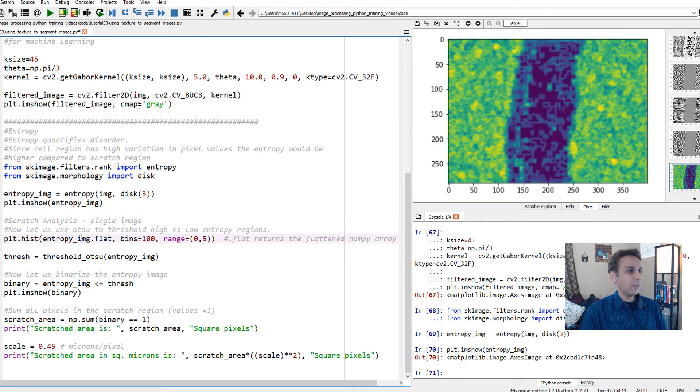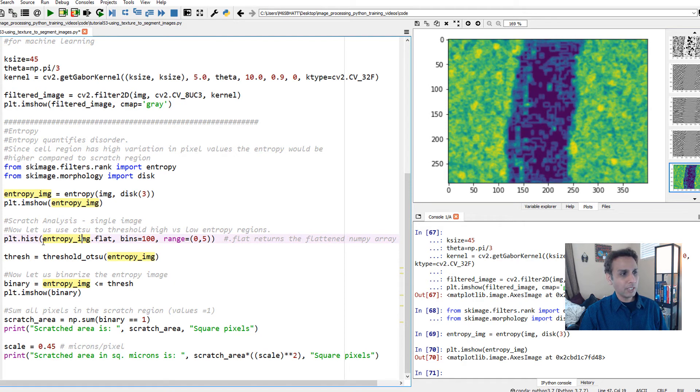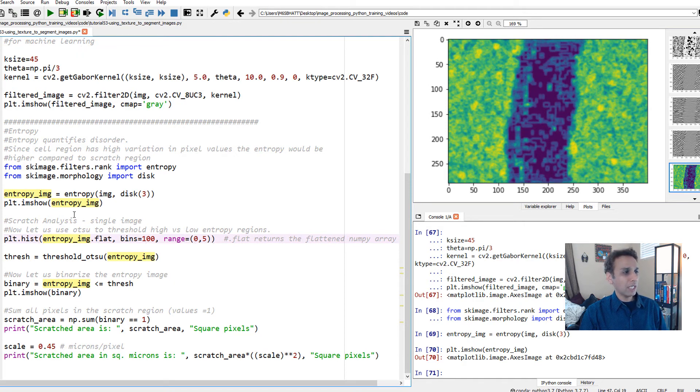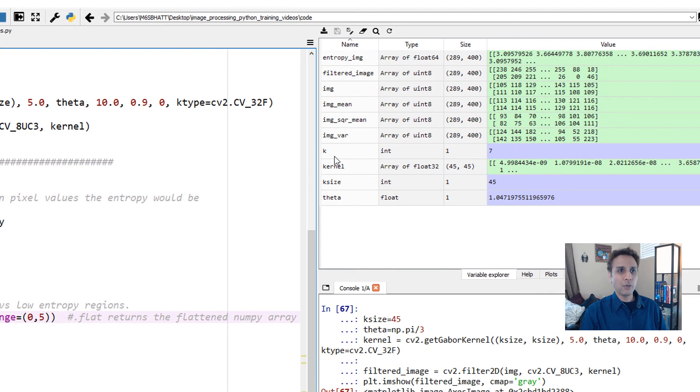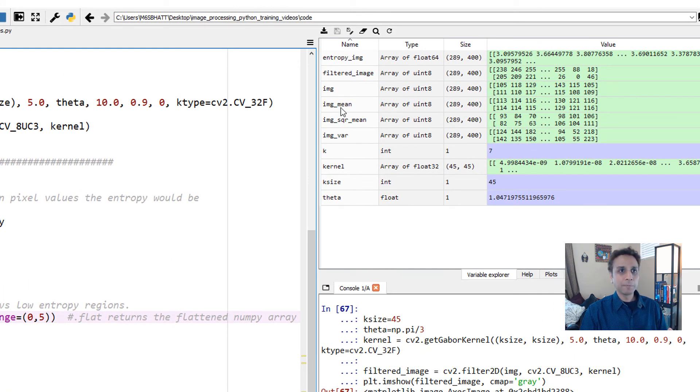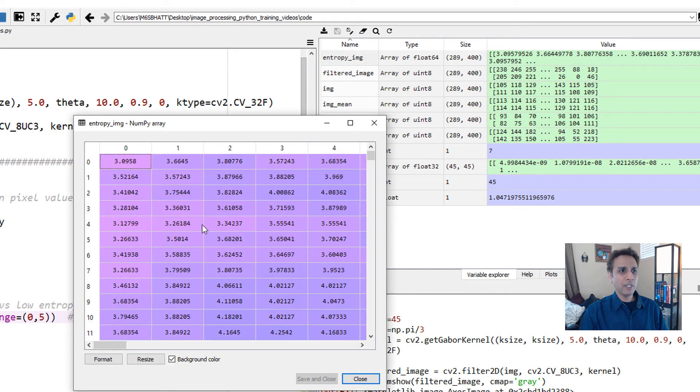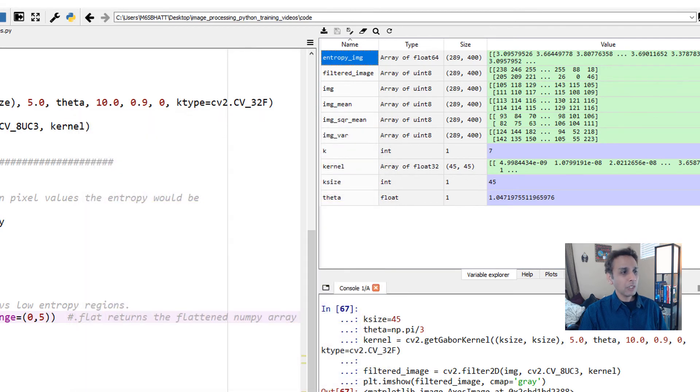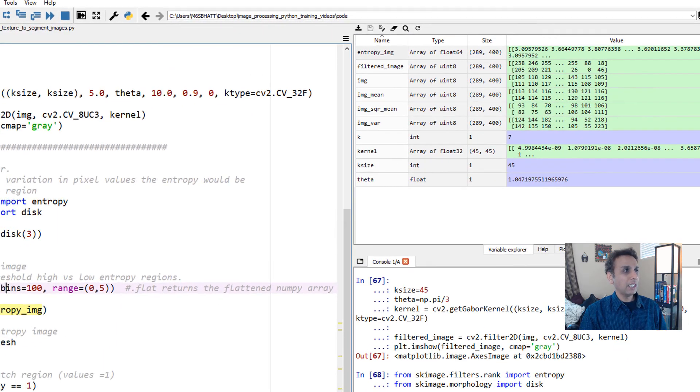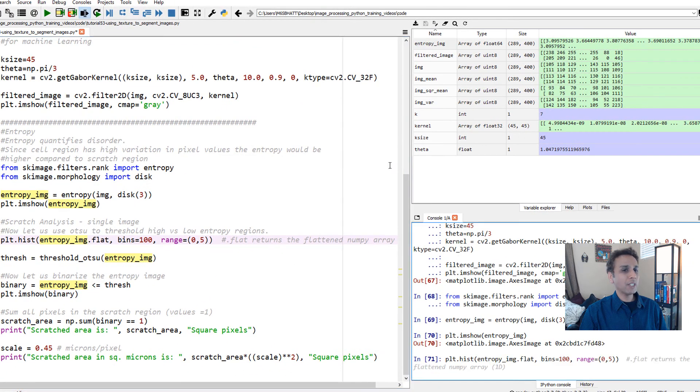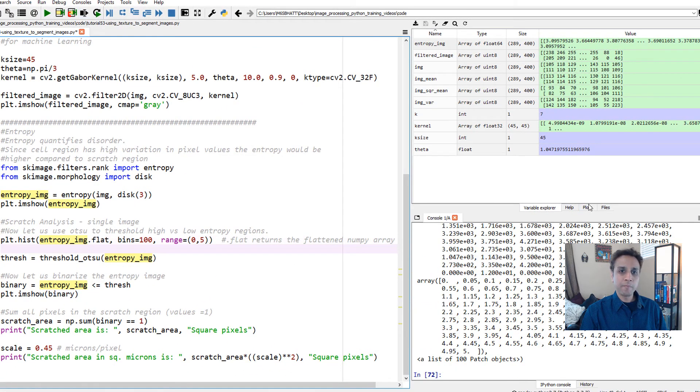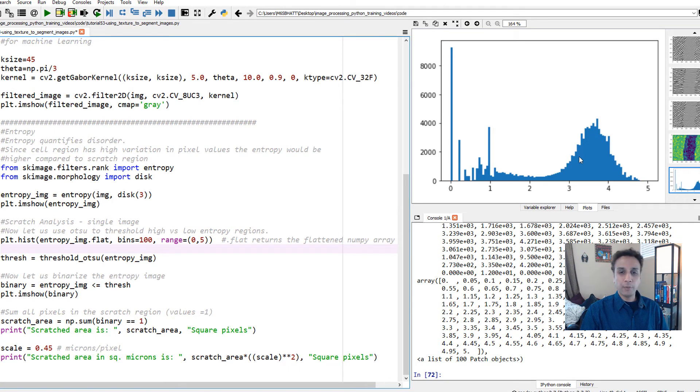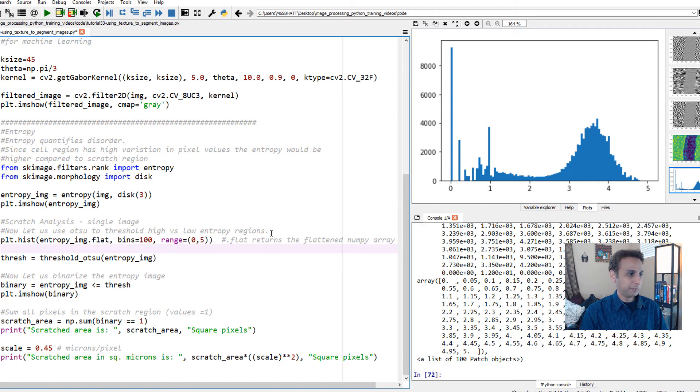In the first image we're quantifying the disorder or non-uniformness by generating an entropy image. Now we supply the entropy image to OTSU. So OTSU can separate this region from this region. If you're new to image processing, this may sound like a trick, but you'll get used to it. Let's have a quick look at the histogram.